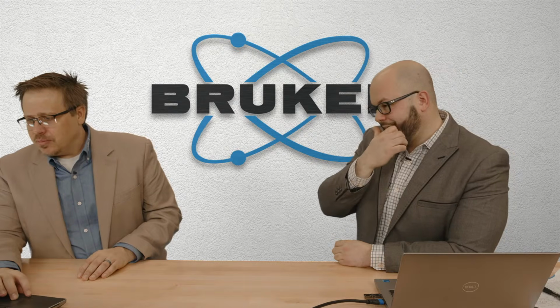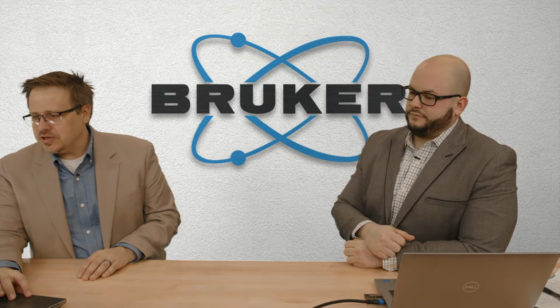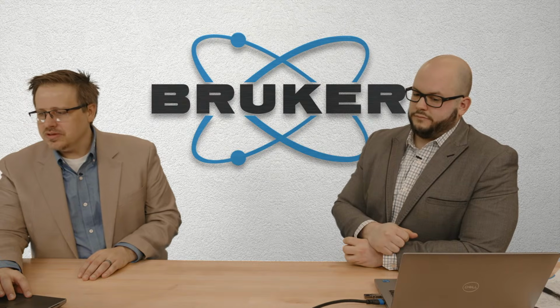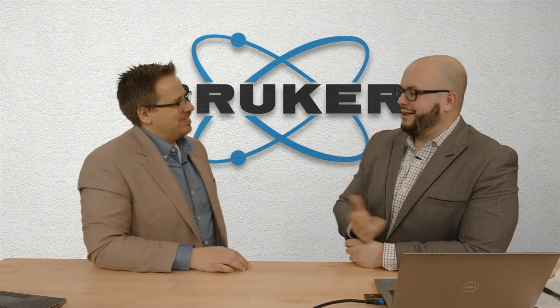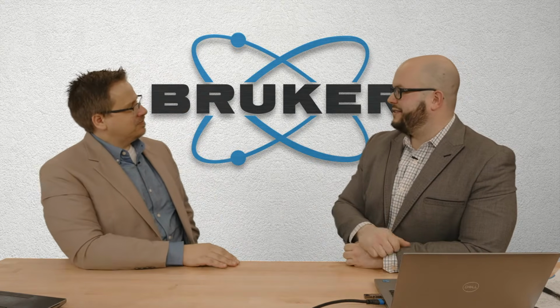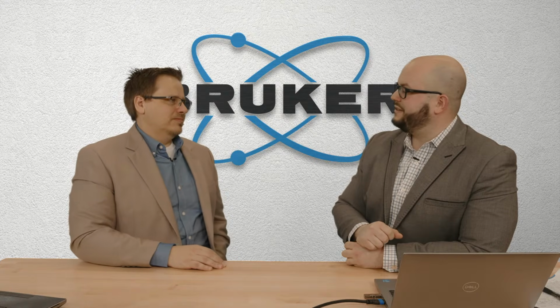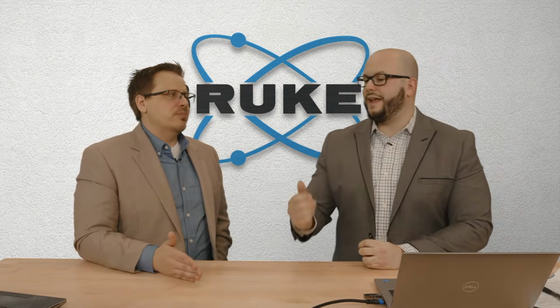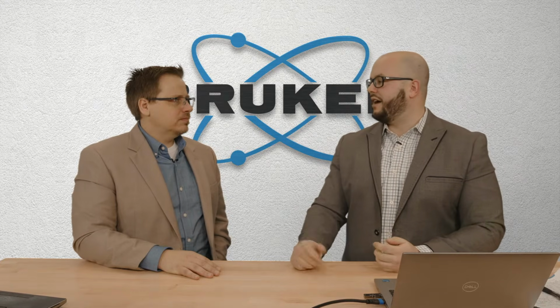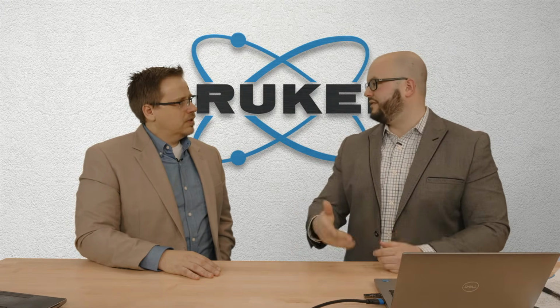All right, from Quang Ho, is cobalt K alpha radiation suitable for residual stress also? Absolutely. It all depends on the material. Well, if you're looking at iron, it's a good one because it avoids the fluorescence and it gives you decent penetration depth. Yep. It doesn't shift that 211 as much, though. Yeah. So maybe you look at a higher order reflection, but it's similar radiation to copper, so that's why it's a good middle ground, wavelength-wise, to copper.